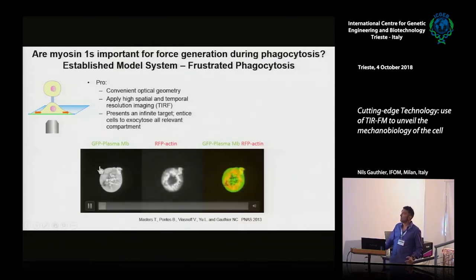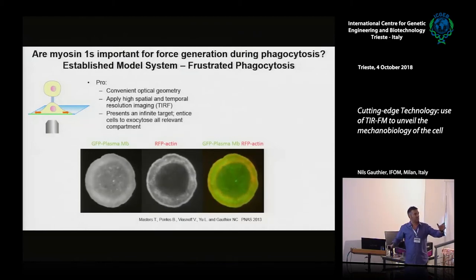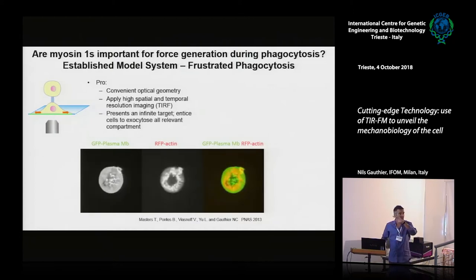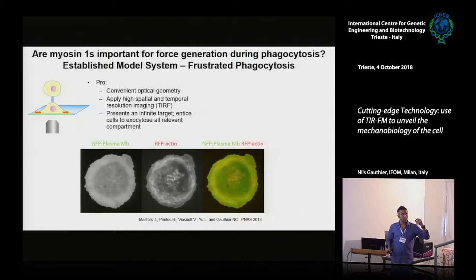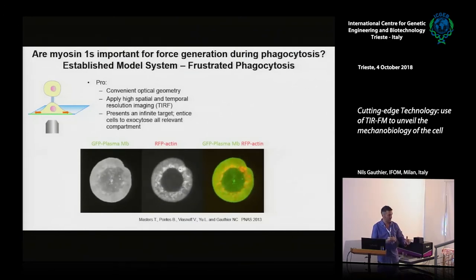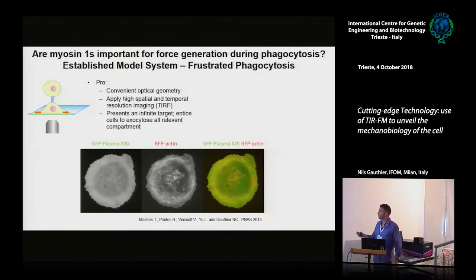And the cell is going very fast, and it's trying to engulf. Then you see the similarity with the spreading that I talked about before with the fibroblast, but this is a completely different mechanism in terms of molecular pathway, at least on the level of adhesions. After, there is a lot of similarity on the level of polymerization of actin and so on.